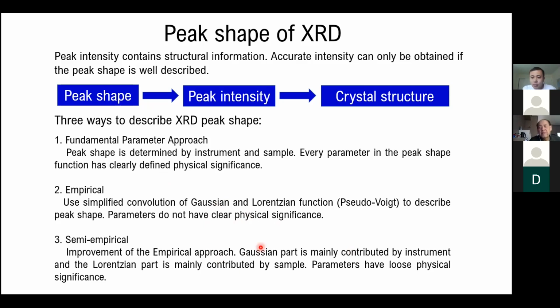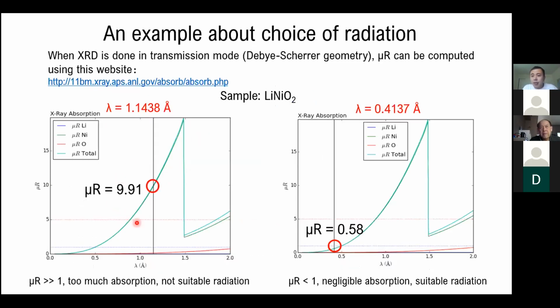Hi, this is Steve. Just wondering, when we are calculating muR, can we relate that to a transmission rate? Yes, are you saying that this is kind of like the reciprocal of the transmission? Or like in synchrotron X-ray, we can compute the X-ray transmission rate when we are doing fluorescence.